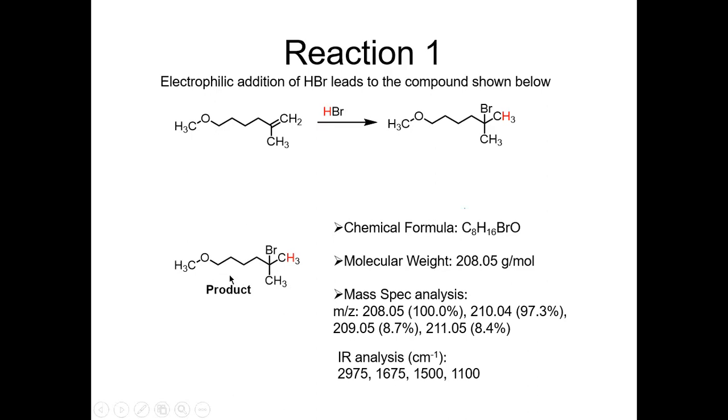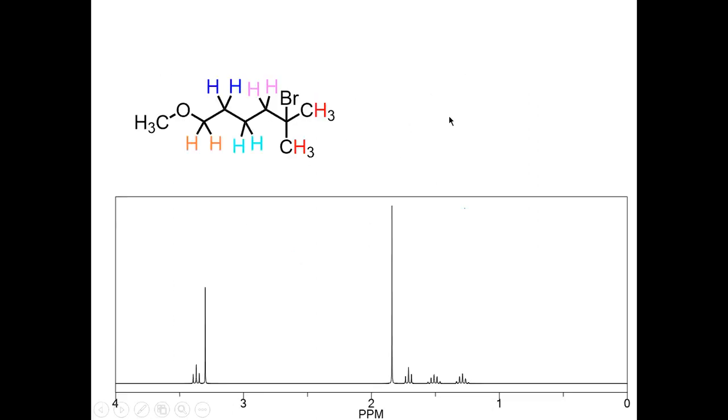All right, so we took this reaction, we did it. Now we got proof that we have it. So you can see right here, these two sets of protons I have the same color on purpose because they will be equivalent. If I replaced either one of these with another atom and compared the two structures, I'll get the same thing. So that's one signal right there.